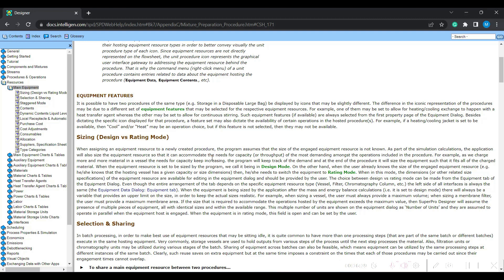So what is design mode basically? When assigning equipment resource to a newly created procedure, the program assumes that the size of the engaged equipment resource is not known. Once you start feeding the material and the process is simulated, it calculates — for this flow rate of material, what is the quantity of that particular equipment required?